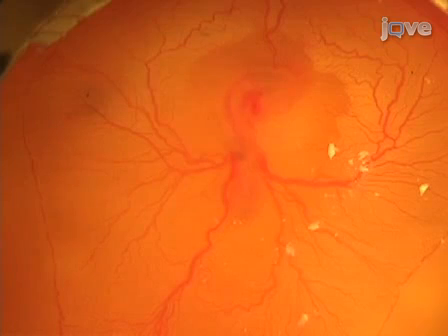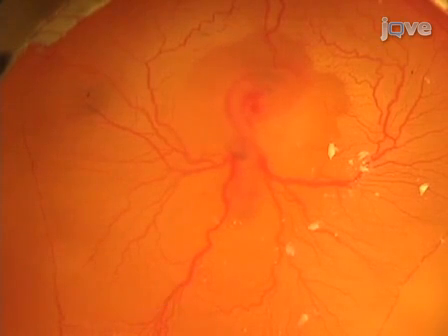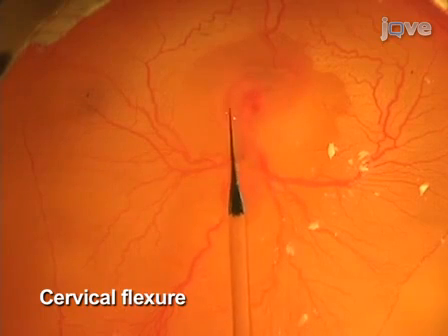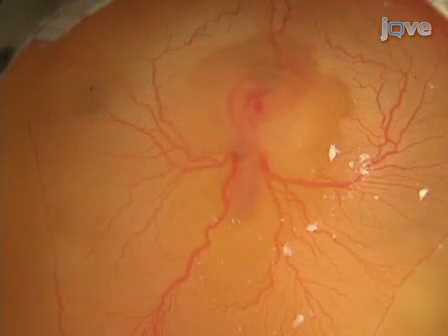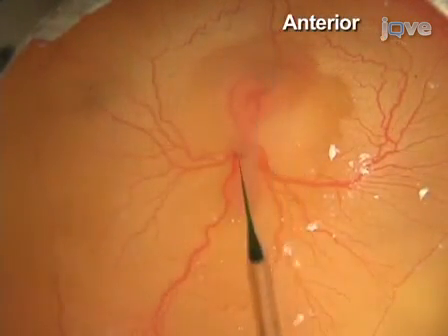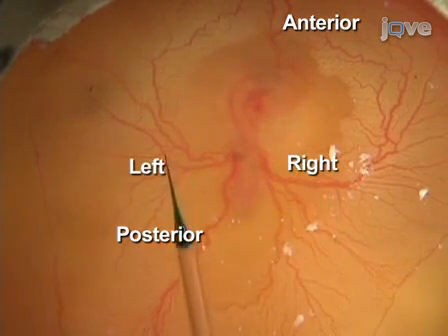The chick embryos are electroporated when they have reached Hamburger and Hamilton, or HH, stage 18 to 20, which is an optimal stage for enhancer-dependent specific expression. At this stage, the head lies at right angles to the trunk. Also at HH stage 18 to 20, a vast set of extraembryonic blood vessels, such as anterior, posterior, right and left vitelline vessels, should also be seen.